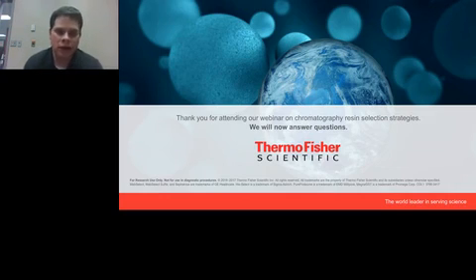I could postulate why. I don't know exactly for sure, but since the magnetic agarose bead has a smaller diameter, it's 10 to 40 microns in size, compared to agarose, which is anywhere from 50 to 150 microns, you have more beads in the same volume.